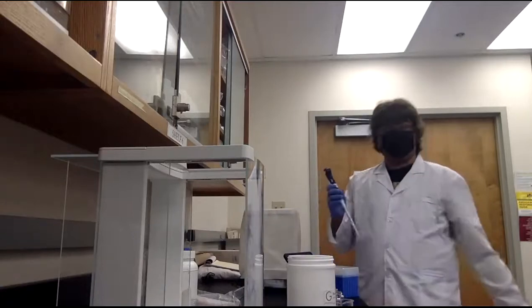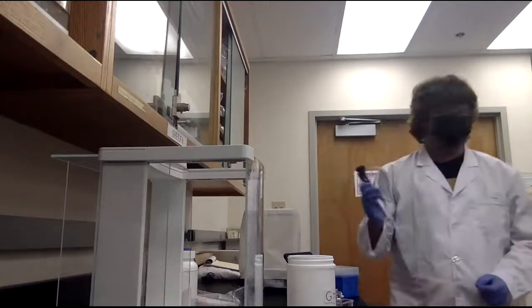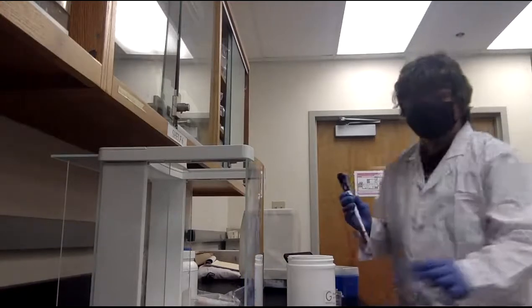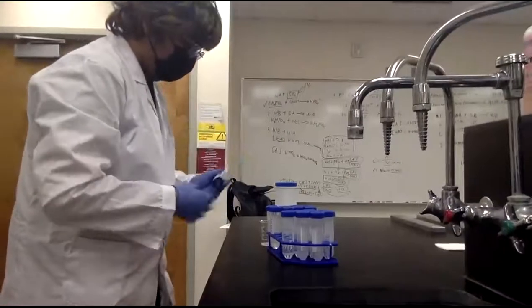And also, since we're using it for the same solution, do we need to change the pipette? No. Right. Where's our? It's right here. So this is the strong base, and this is strong acid.